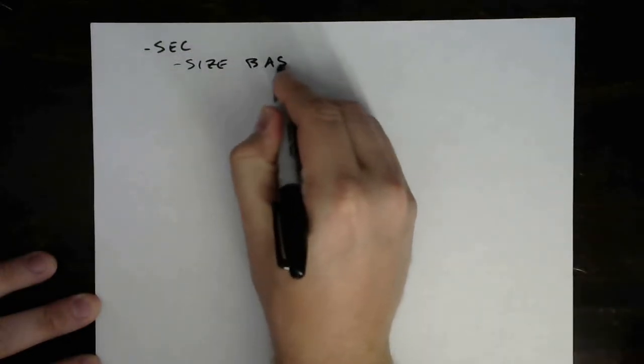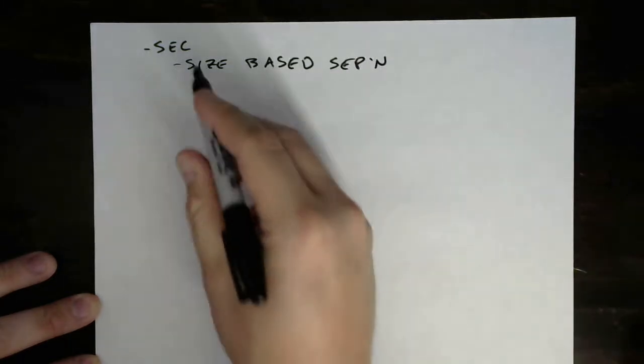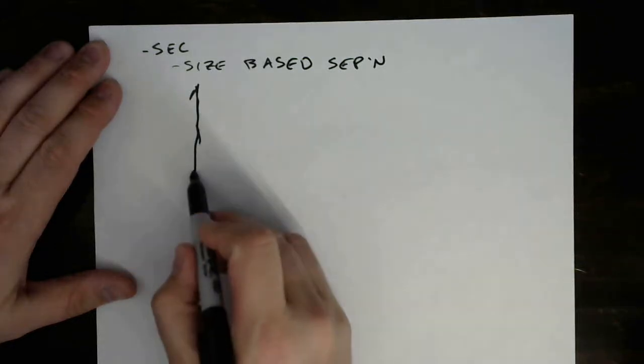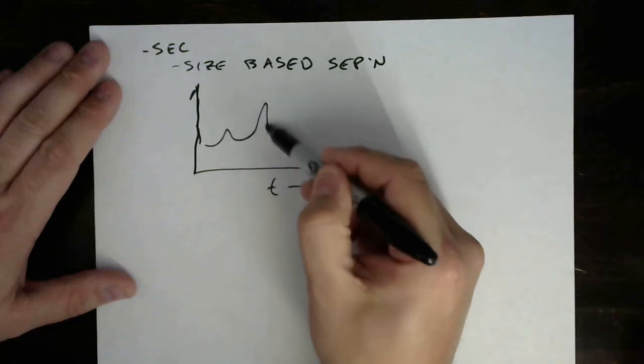And what we see in these chromatograms is something that looks like this. I think this is the very last thing I drew on the board before we left and the world imploded. We see these peaks.